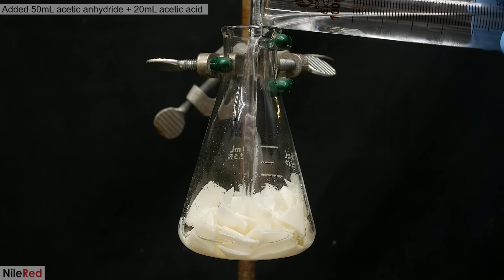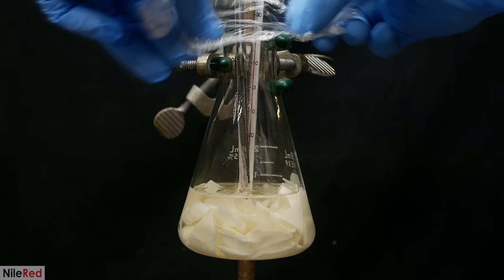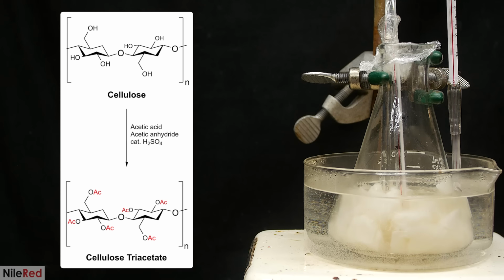To do this, I add a mixture of acetic acid and acetic anhydride, cover the top, and put it in a hot water bath. I also added a thermometer, but that wasn't really necessary. The water bath's held at a stable 50 C, and the flask is kept here for the next 30 minutes or so. What's happening here is a reaction between the acetic anhydride and the hydroxyl groups of cellulose.